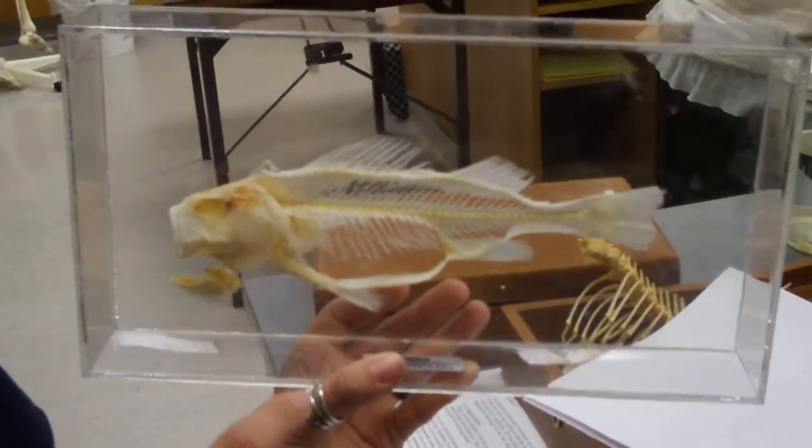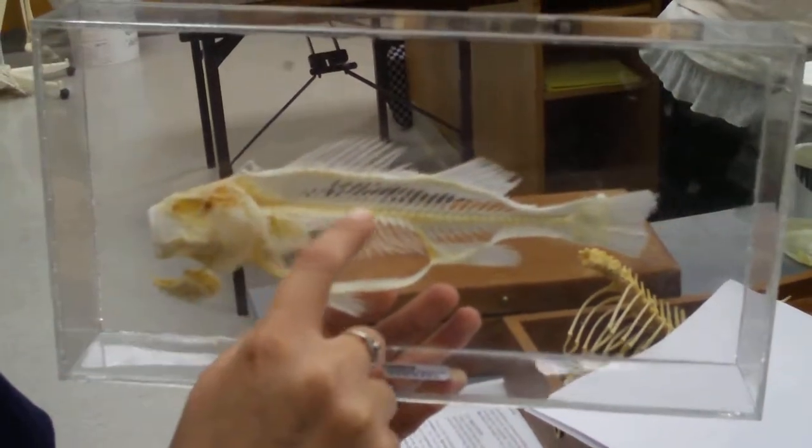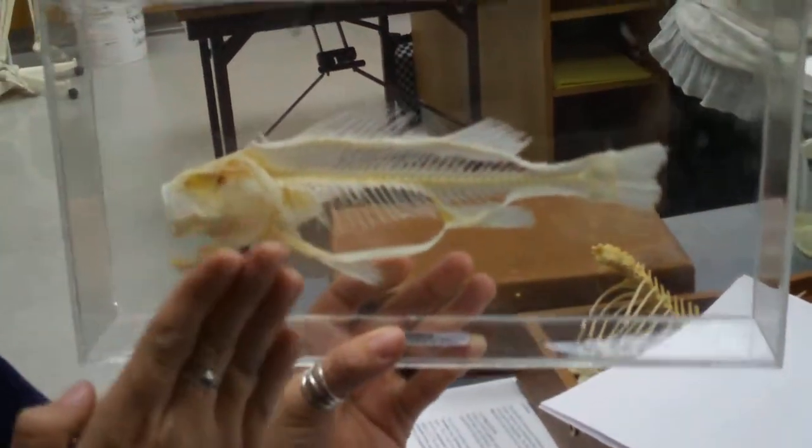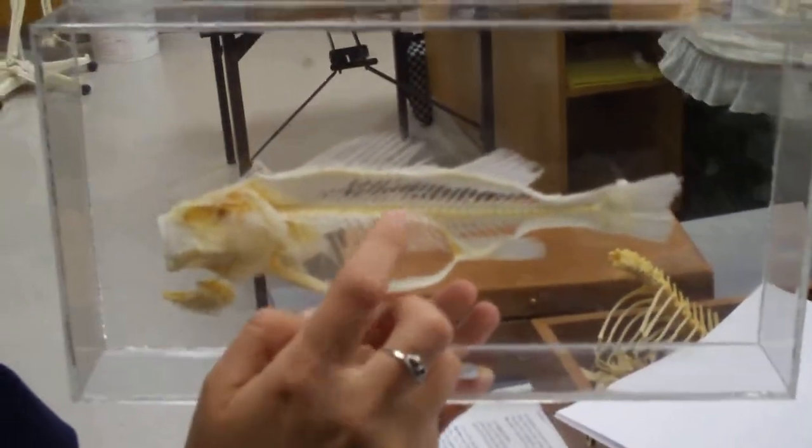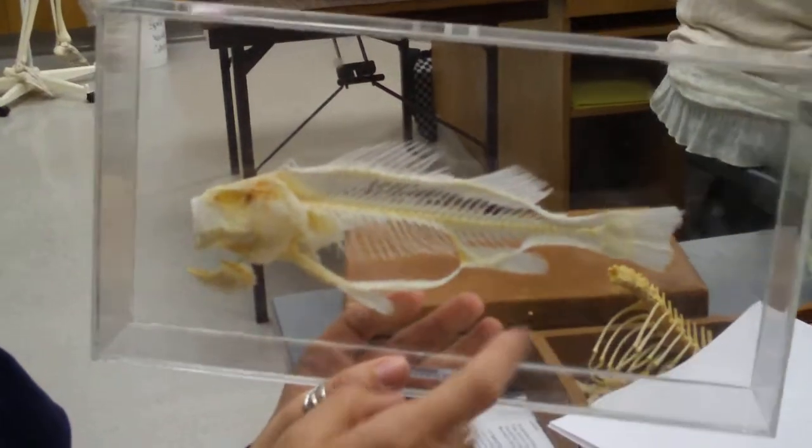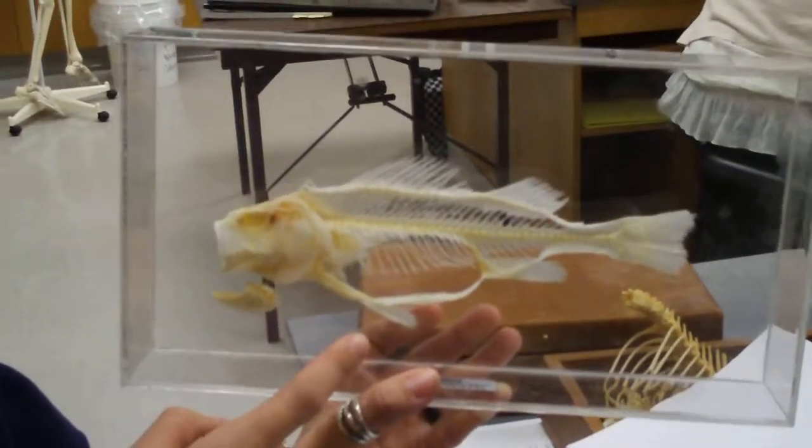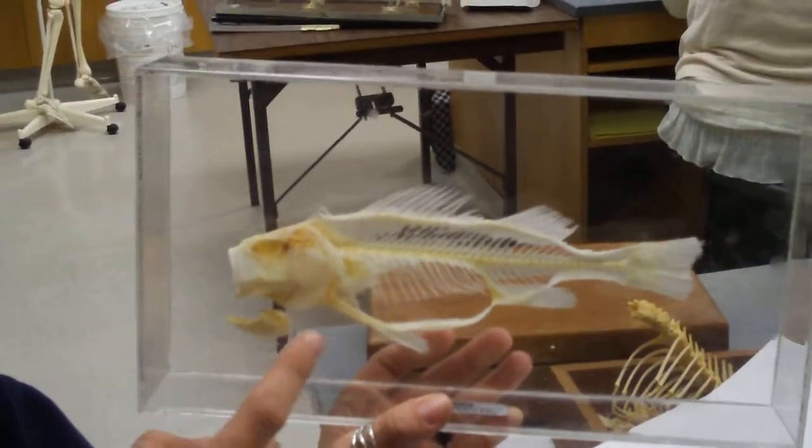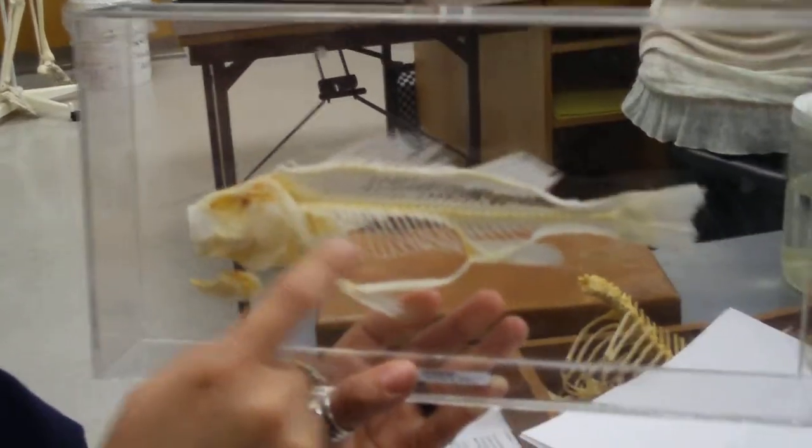Okay, then running all the way down the back right here, you can see the bones that are sticking up off of the vertebral column. Those are your neural spines. That's the caudal fin, anal fin back here, pelvic fin, pectoral fin.